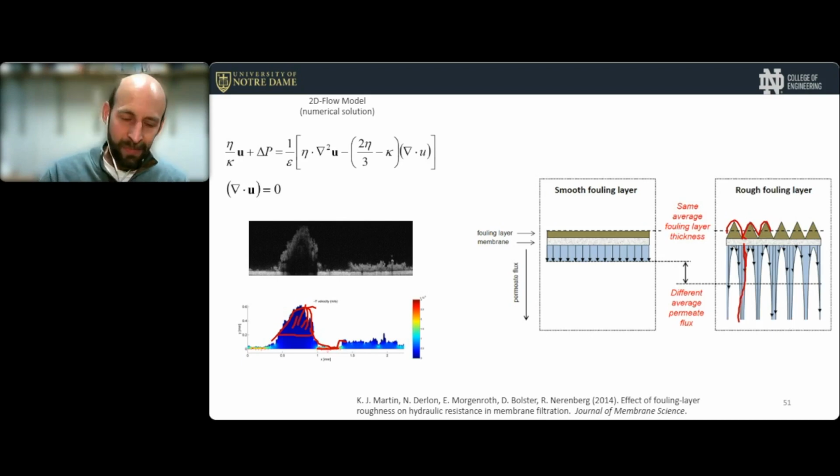So this is how we got involved with OCT, and we were really excited. We thought this was a really neat application that allowed us to take a very large scale biofilm and convert it into information that was tractable, and we were able to model it. So again, we used many of these profiles for this research.